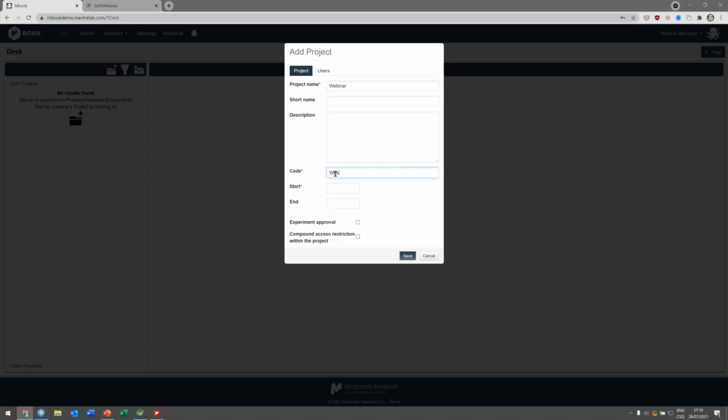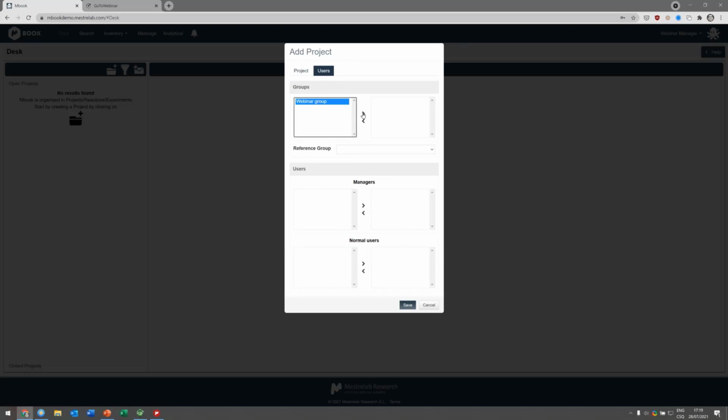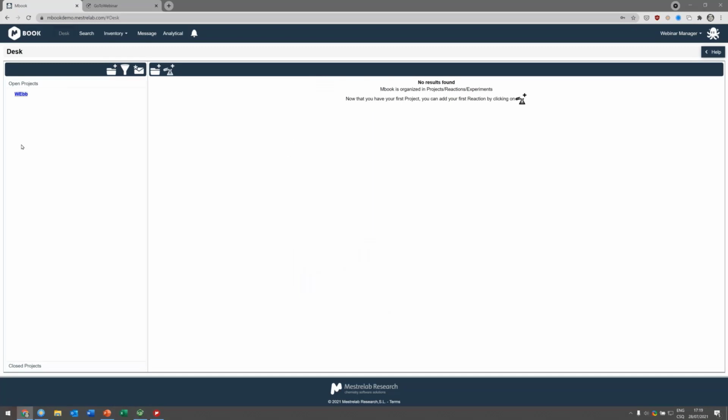You will put there some code, and let's start today. For the users, we will select the group of webinar, and we will select the webinar managers, and also all the guests we can add here. So everyone in this project will have access to the project.